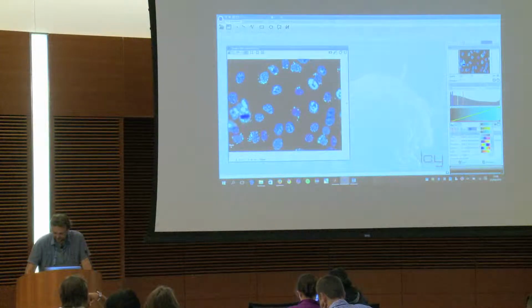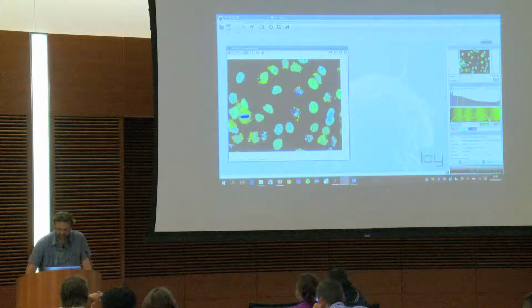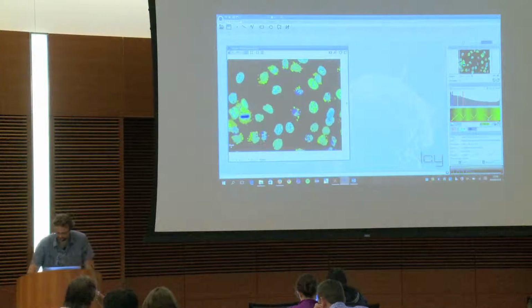And what is funny is that you can actually create yours. So if you click on this lookup table, you see that you can create new points. And you can even build an RGB lookup table. You just need to click on the red things or in the blue one.